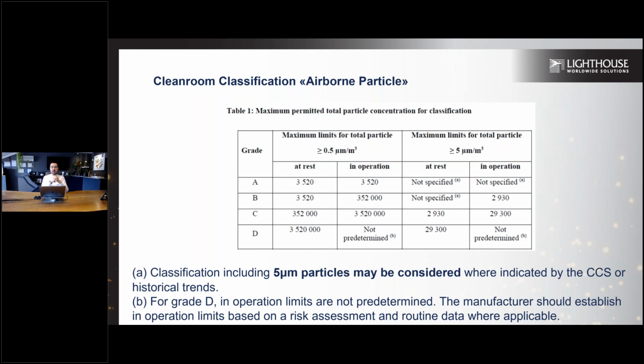700 liters in each location to see the changes from 1,000 liters to 700. If I'm still on the safe side of the operation, then I can lower this number to 600, 500, 400, whatsoever. But for me, my personal idea, moving from 1,000 liters all the way to 24 liters, if you are using a 100 liter per minute instrument, 10 minutes to 1 minute, is a dramatic change for pharmaceutical production.